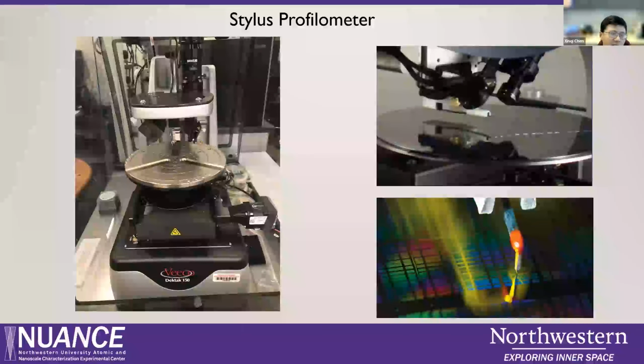Okay, so stitching feature, of course, is useful. That is a stylus profilometer. The left image is our stylus profilometer, and on the right you can see the tip. This we call the stylus. This stylus is made of diamond. The end part is made of diamond, which is very robust, reliable, durable and sturdy. They can be used for a very long time. The bar is made of steel, and it senses by the deflection of this.